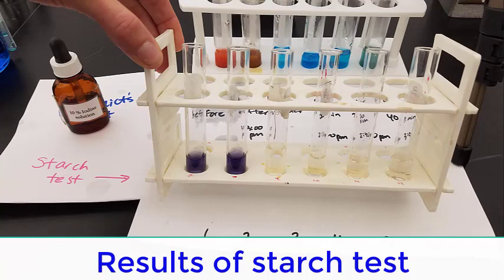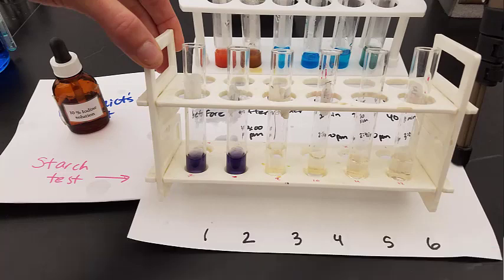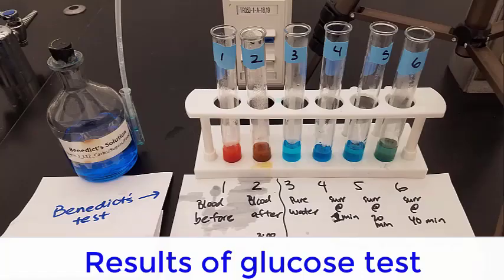Next up, the starch test. Test tubes one and two on the left are blood before and blood after. Definitely some starch there. Test tube three is water, and four, five, and six are the surroundings. Think about whether any sugar moved into the surroundings.